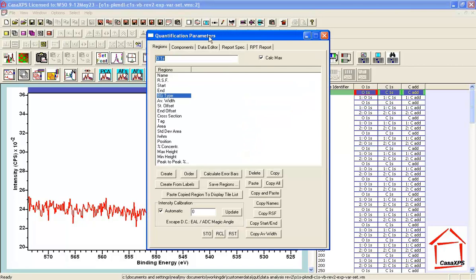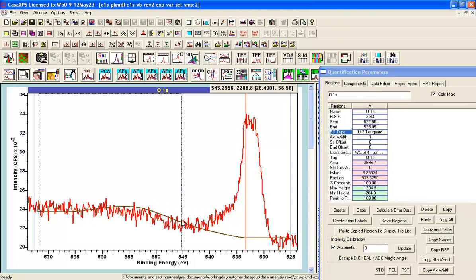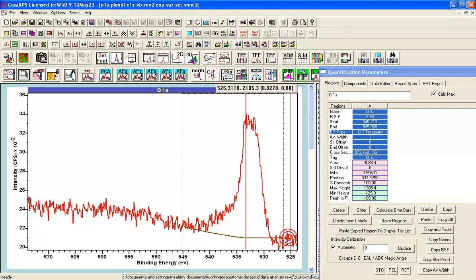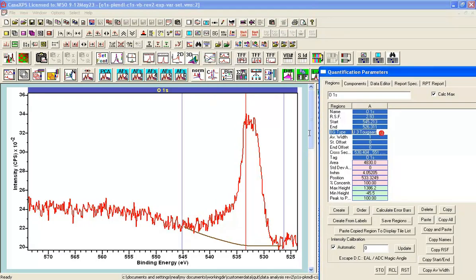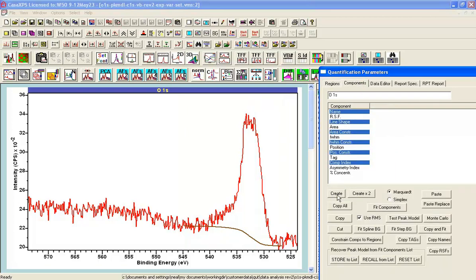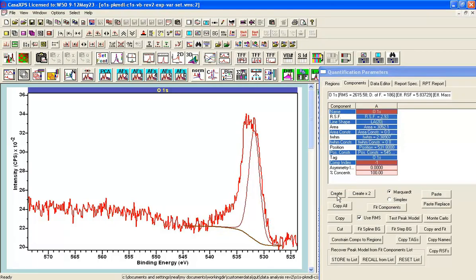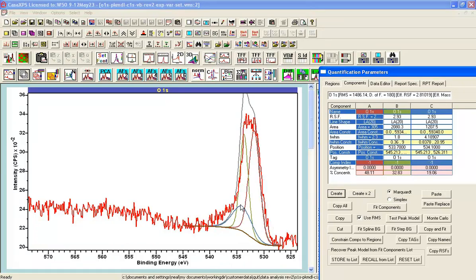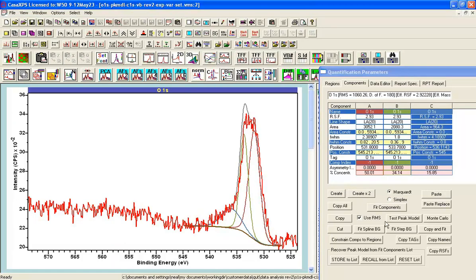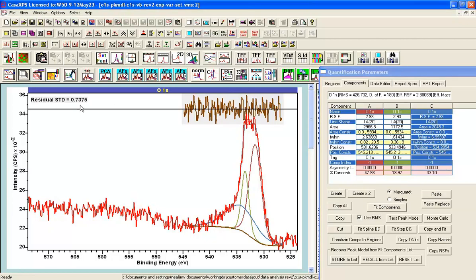Constructing a very basic peak model might take the form of putting a background in — let's change this to be a Shirley background — and then adding some component peaks. Perhaps three peaks of this form. We fit and look at the residual, and this looks like a very good mathematical fit for these data.